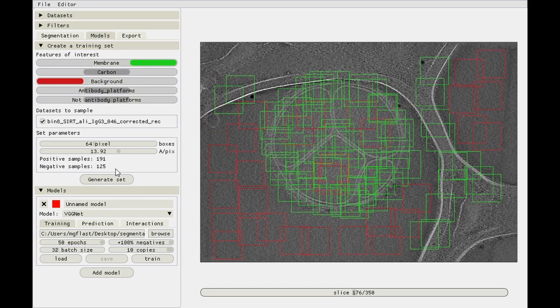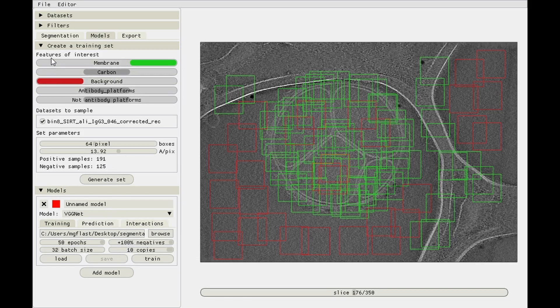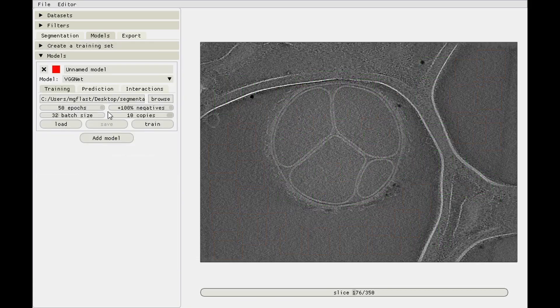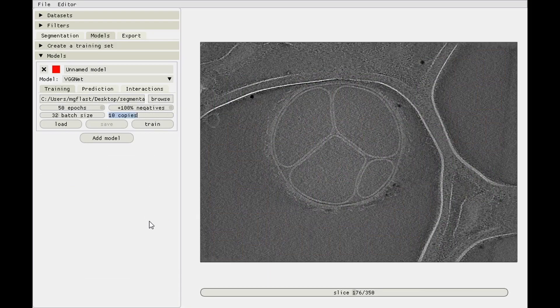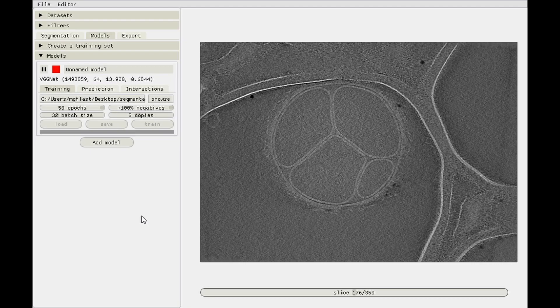Plus 100% negatives, and then 10 copies. In this case, the training dataset for membrane contains 191 positive samples, so we'll have 1900 positive samples and then twice the amount of negative samples. Maybe actually that's a bit much, so let's set the amount of copies to 5.